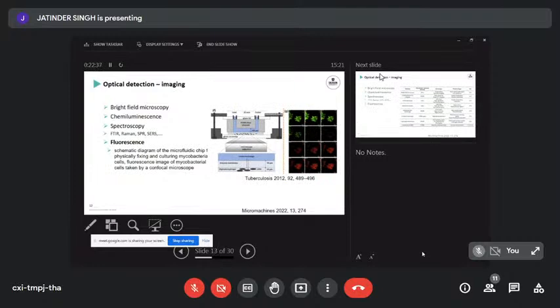There's a fair bit of work being done with cell imaging, and this here is an example where we've got a microfluidic device made in PDMS. PDMS was that stuff, the swashy stuff. So it's a PDMS microchannel where they're culturing some bacteria causing tuberculosis. And here you can see that they've applied a couple of different stains.